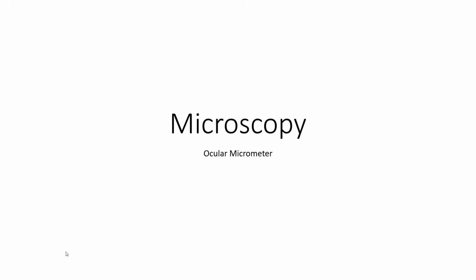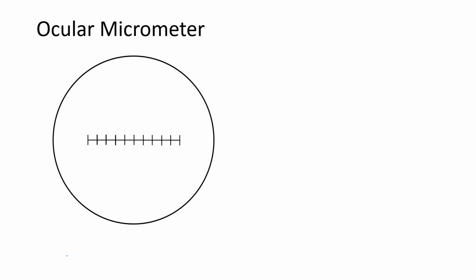Hi everybody, this is Dr. Ramey, and I'm going to cover how to use an ocular micrometer to determine the size of a specimen.